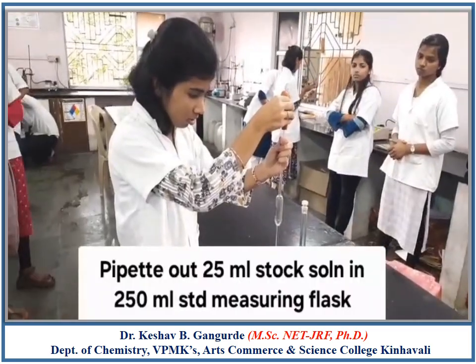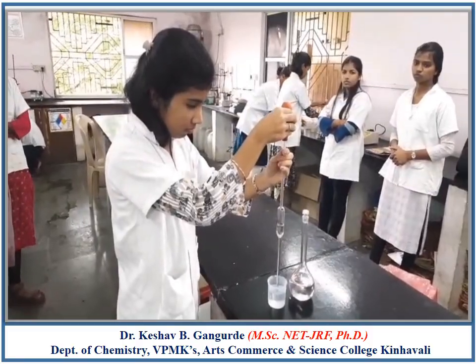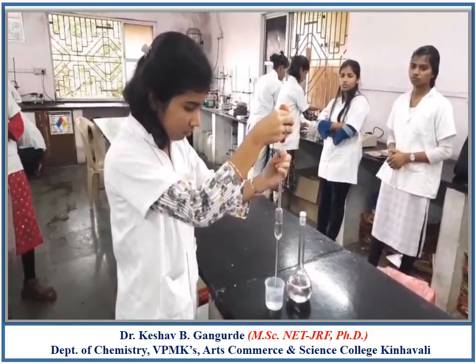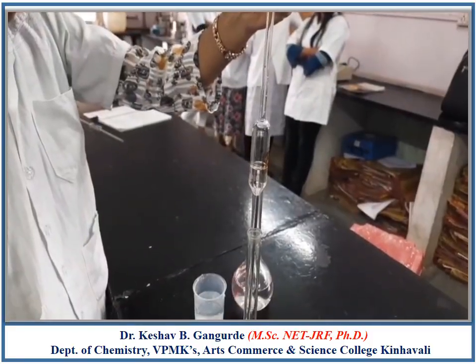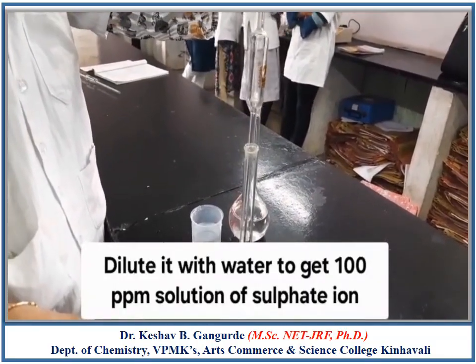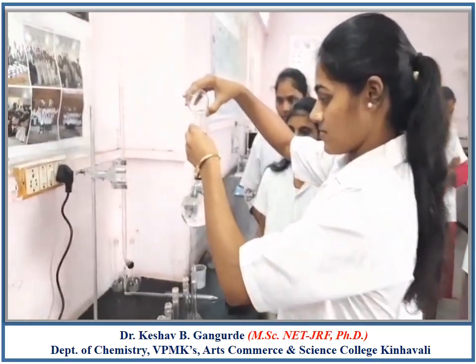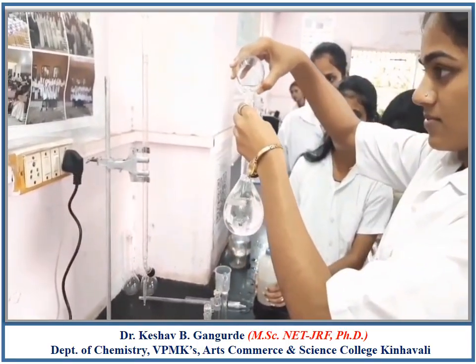Pipette out 25 ml of 1000 ppm sulphate ion solution into a 250 ml standard measuring flask and dilute it with distilled water up to the mark. This results in the formation of a 100 ppm sulphate ion solution.